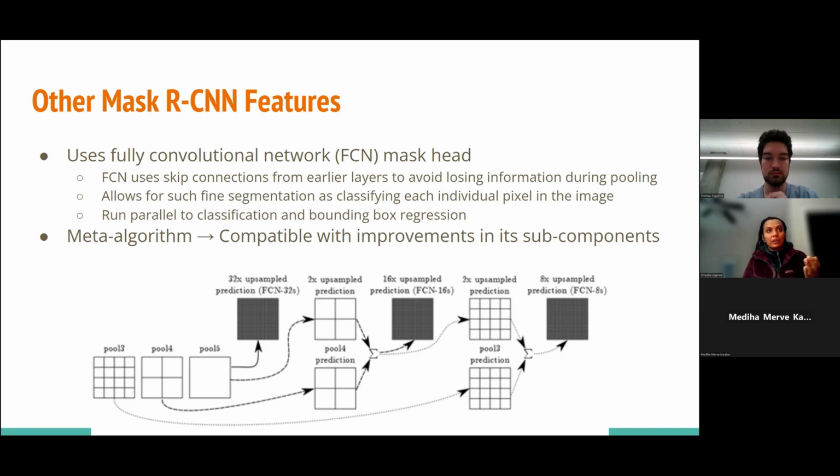So here in Mask R-CNN, and also in other versions of R-CNN, I think Faster R-CNN, ROI pooling plus your feature detection are overlapped, right? You were explaining that kind of extrapolation, I think, it is just applying that kind of algorithm. And when you use a sliding window, and the stride length is not equal to your ROI, in that case you lose the information, right? So what is the remedy to losing the information in the leftover stride length?